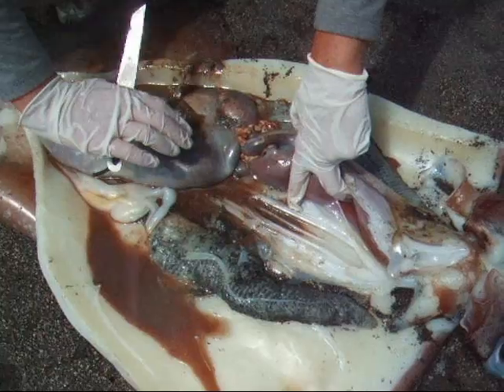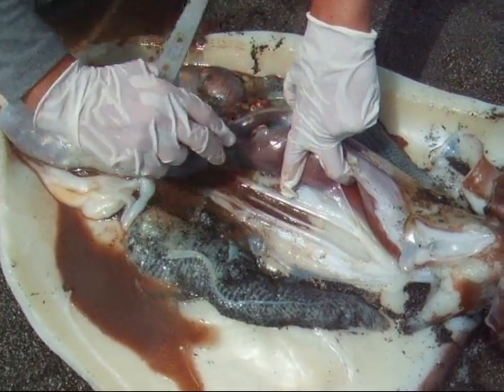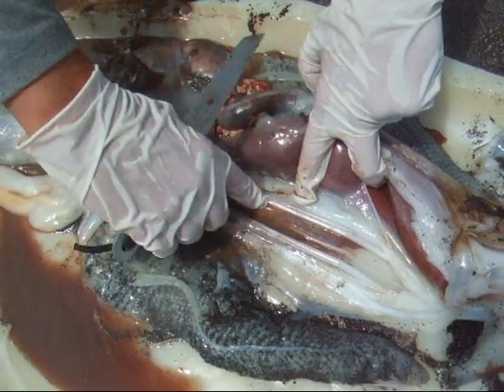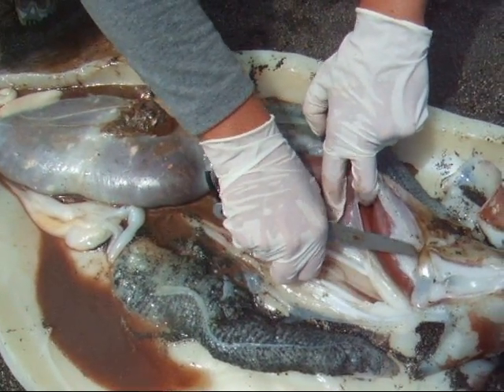I've moved away all the internal organs to expose this structure underneath. Squids do not have shells — this is all that's left of their shell. What is this structure, and what is it made out of?